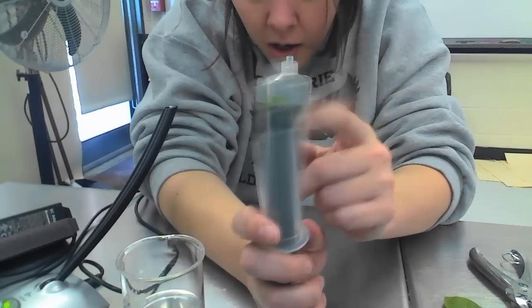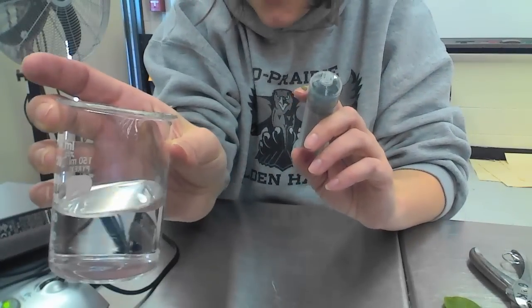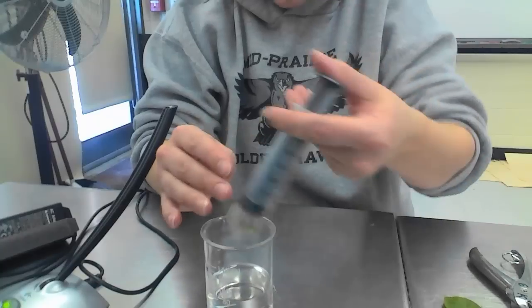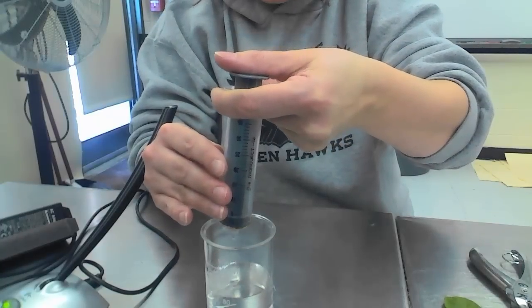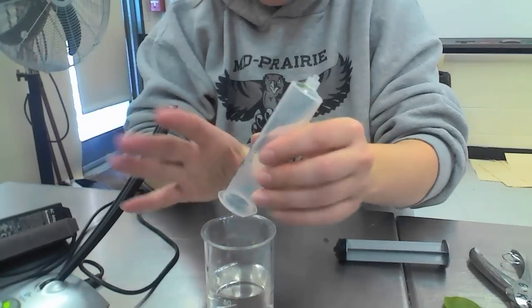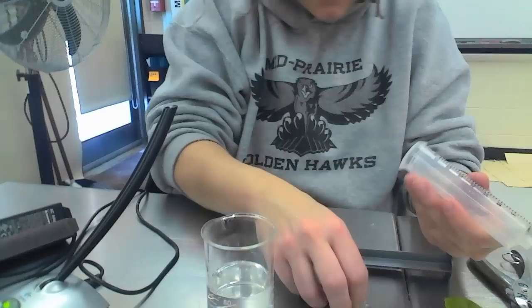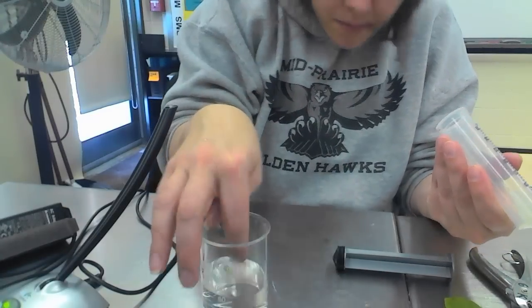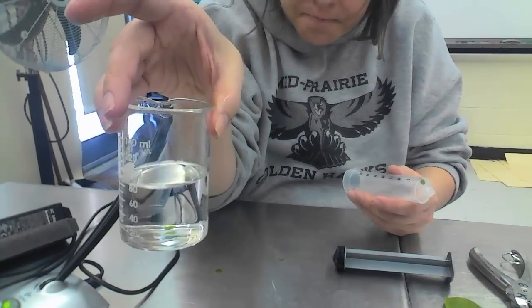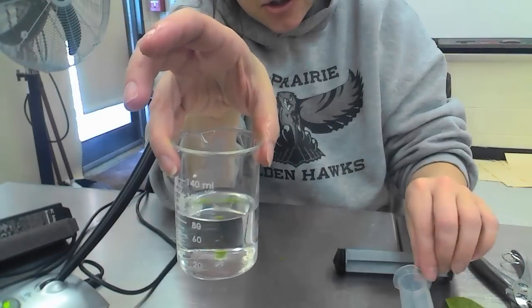Once you have them all at the bottom, you're going to place them into our beaker of carbon dioxide water. So I'm going to do that. Once you do that, you'll notice that they start to sink. So you're going to put all the chads that have no air bubbles in them down into your beaker.